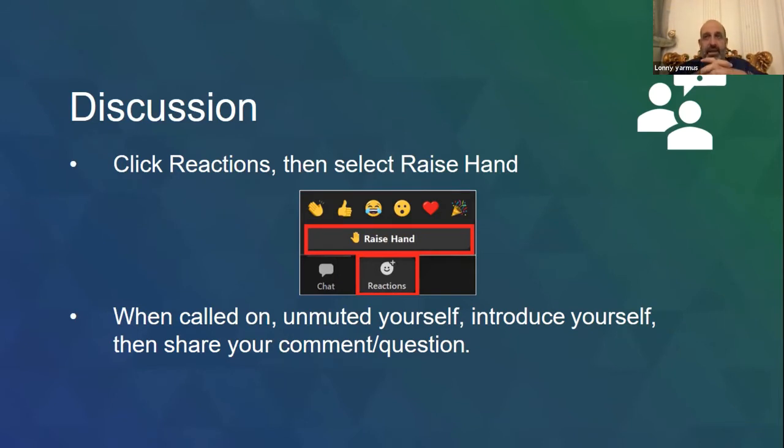We think, again, it's going to be that cellularity piece through the clot technique and binding of those cells off that filter paper and wicking away much of the mucus and sputum and blood that allows sort of a tighter congealed specimen. Have you ever forced, let's say, or did you send away any specimens and you needed fixation and transport medium? And what would be those if you need to send away the specimen?